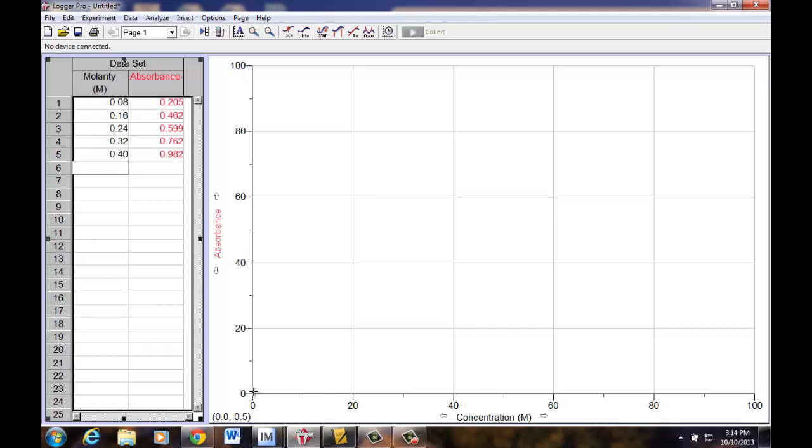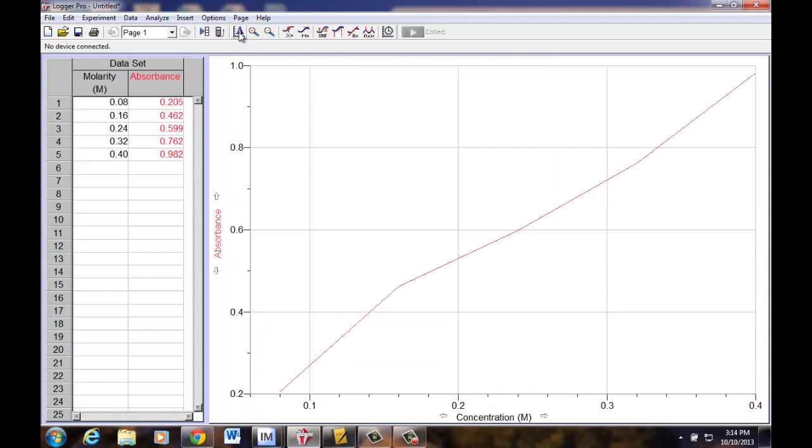Now here's what's going on. See this little area? That's the line that we have. Obviously if we go from 0 to 100 in both directions, this isn't the best scale. But here's a great trick. See this A up on the menu bar? The A stands for auto scale. Simply click that menu button and look what happens. It automatically scales to the best fit. So for my concentrations, oh look at these numbers, they're not the best straight line, but perhaps yours is going to resemble this. Just visually, the more straight the line, the better off my mixing was. And you can get a little visual feedback of your precision from mixing solutions.